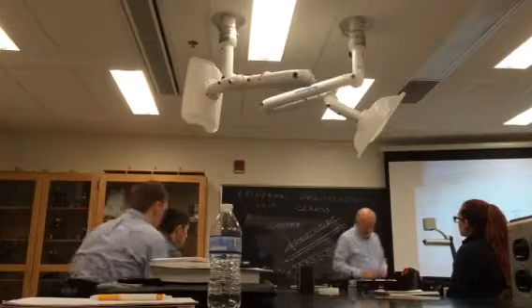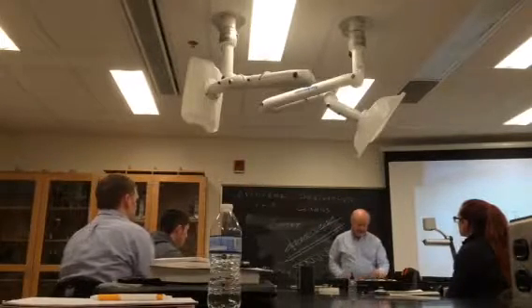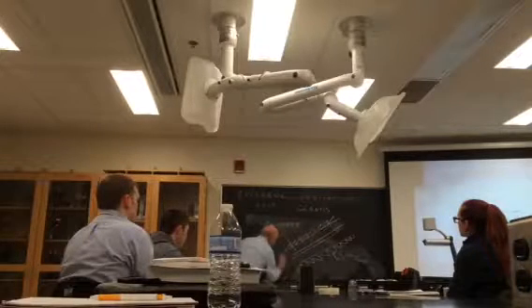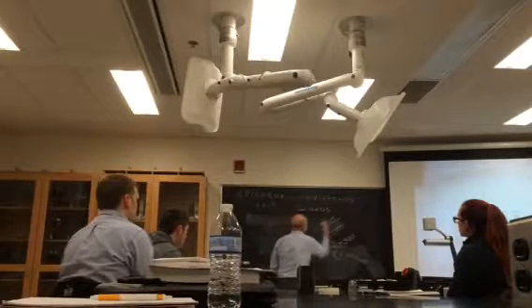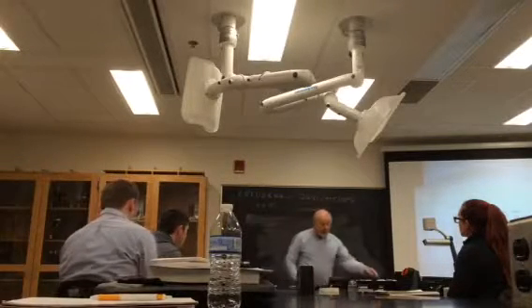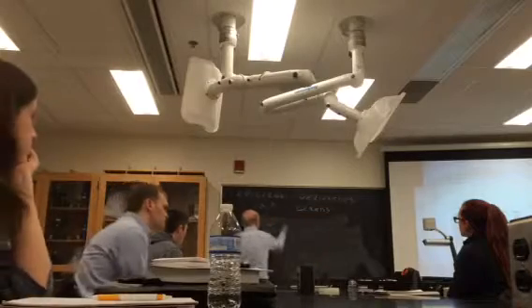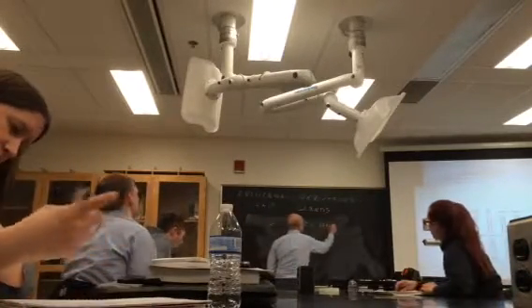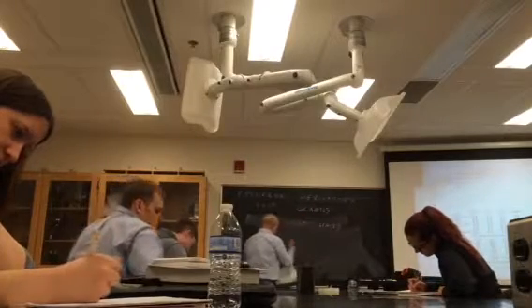As evidenced by the cuticle of the hairs. You do have different types of hairs. The most common types of hairs are guard hairs and what's called under hairs.